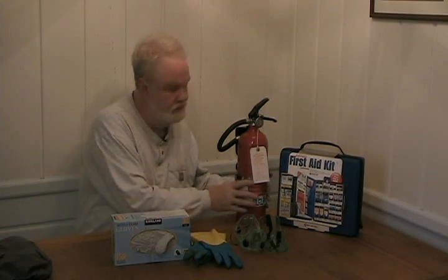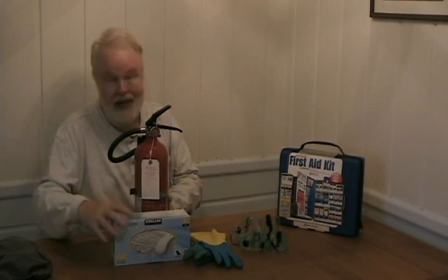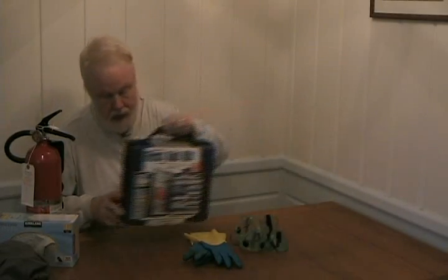Two final items that you'll need in terms of laboratory safety. First, an ABC rated fire extinguisher, because accidents do happen and if something catches on fire you want to have the means to put it out yourself. And second, a first aid kit, because accidents do happen in a lab. Usually they're the nature of minor cuts and burns, but you do want to have whatever you need handy to treat those.